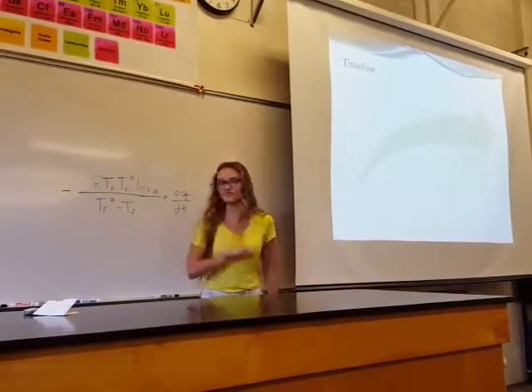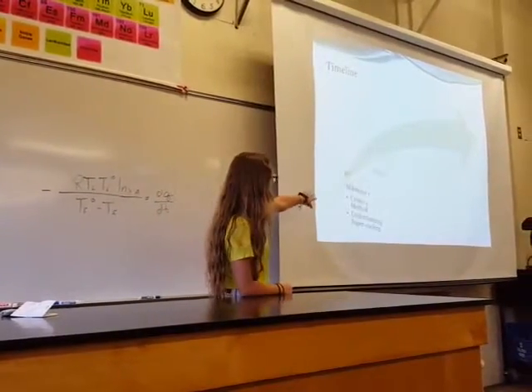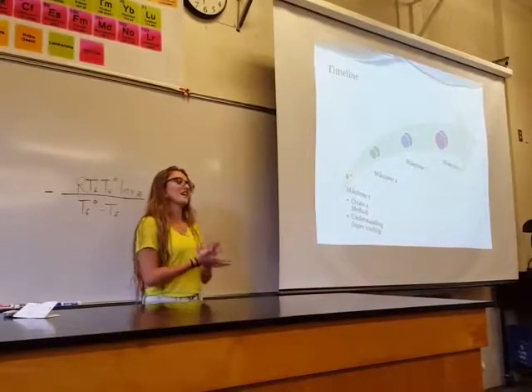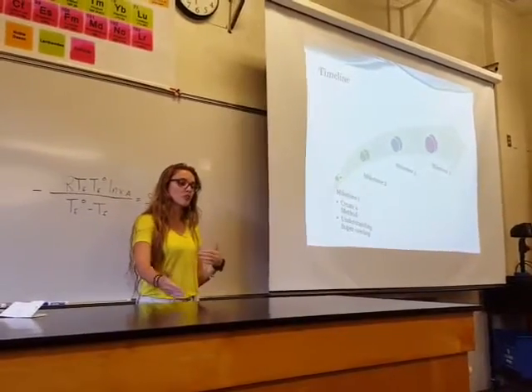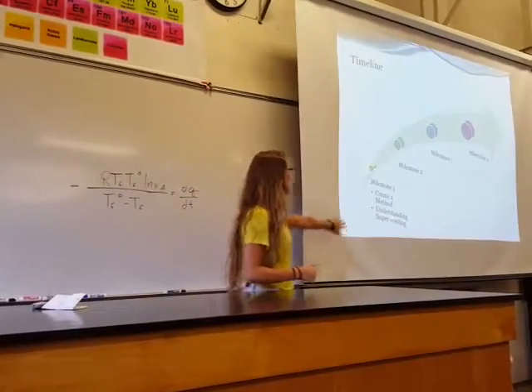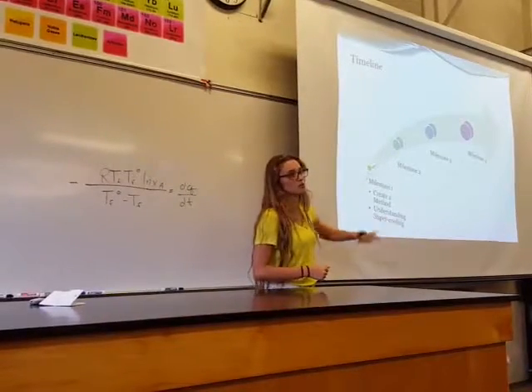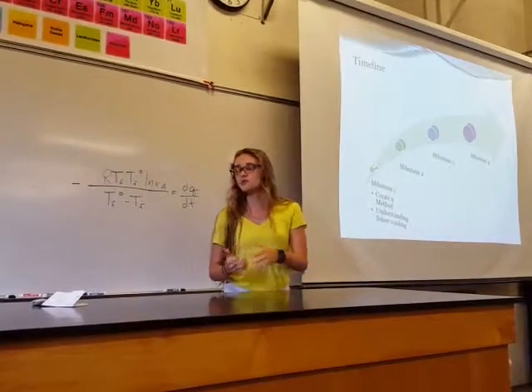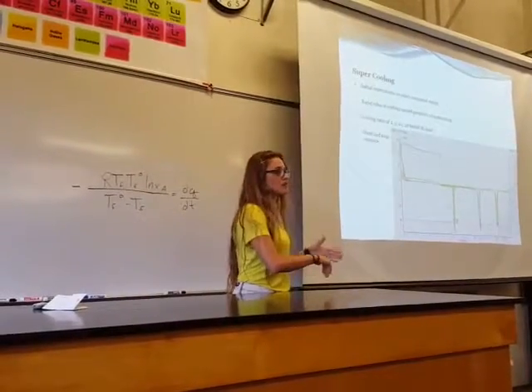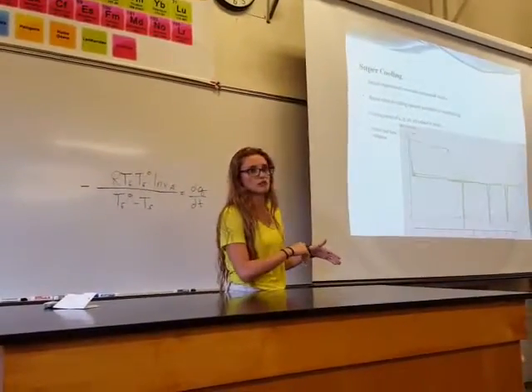We can click through this one really quick. So our first milestone was to create a method, but we ran into a problem, and the results that we were getting weren't what we expected. And so we also had to understand supercooling. And so supercooling is this effect that happens when you freeze something really fast or really slow.